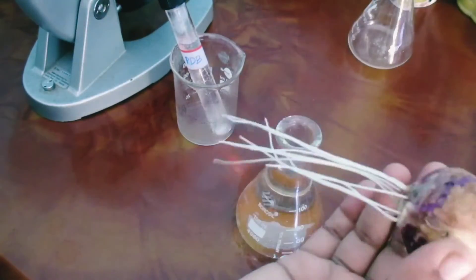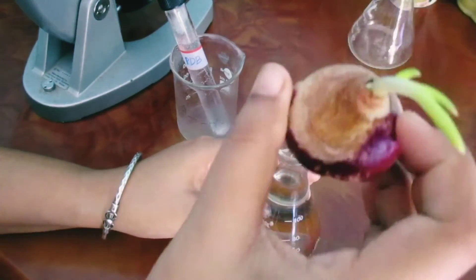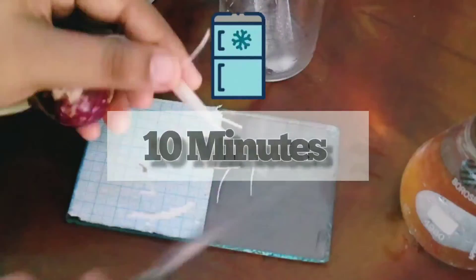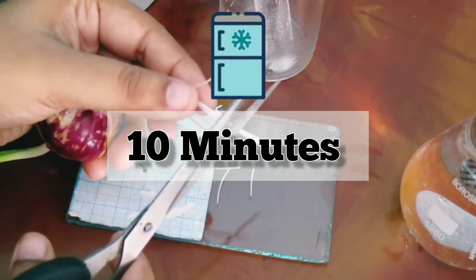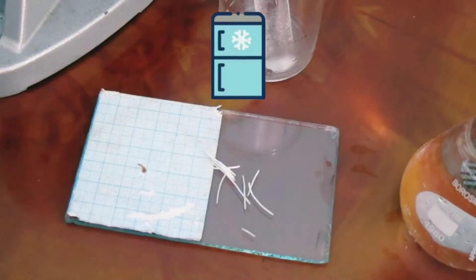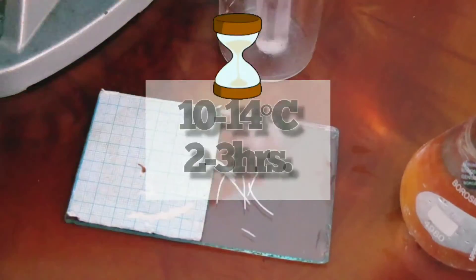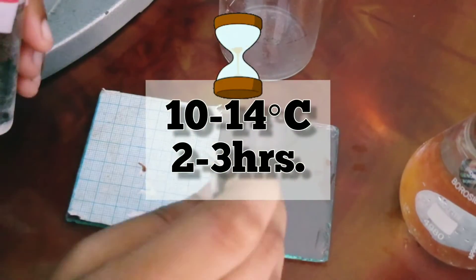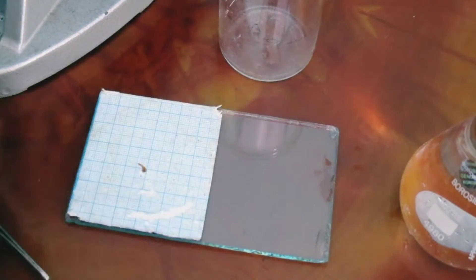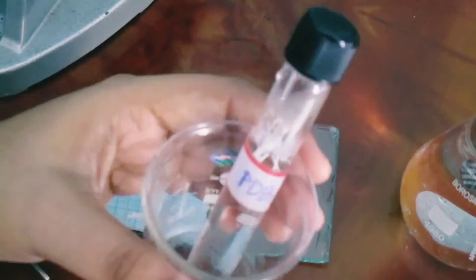The root tips are pre-treated in a saturated aqueous solution of paradichlorobenzene. The PDB solution is kept in the ice chamber of a refrigerator to chill it. The root tips are put in the chilled PDB solution and further chilled in the ice chamber for 10 minutes, then kept at 10 to 14 degrees centigrade for two and a half hours.